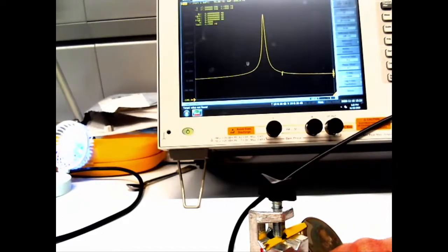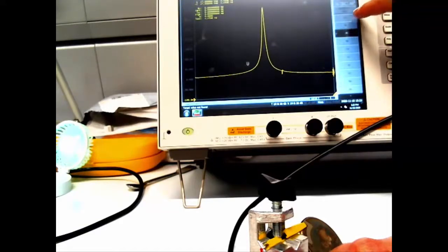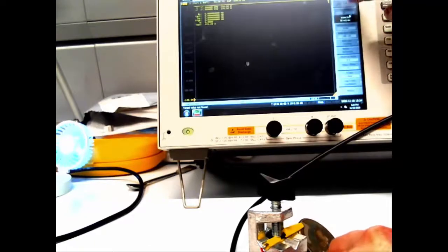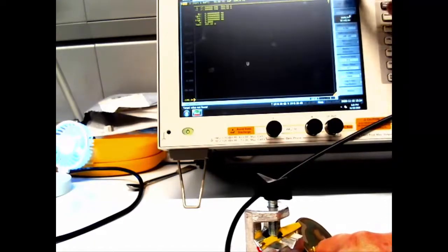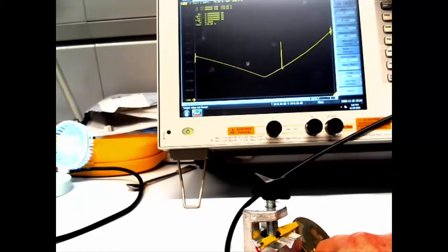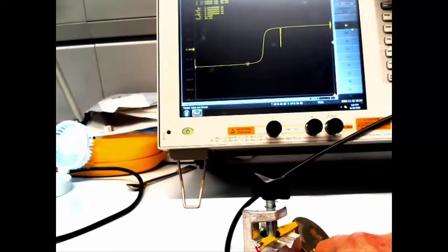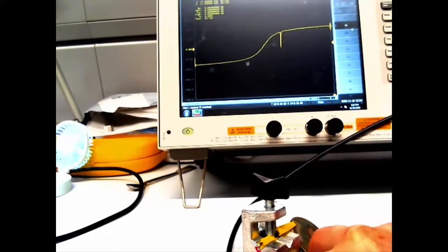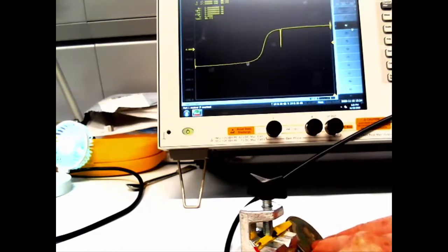So we can have a quick look at what the other things do, if I can remember how to do that. Yes, okay, here. So we can look at the impedance, and get back on it, or auto scale that. Ooh, that's ugly. Here is the phase difference. Whoops. Yeah. So it doesn't like that because it takes a lot of power.